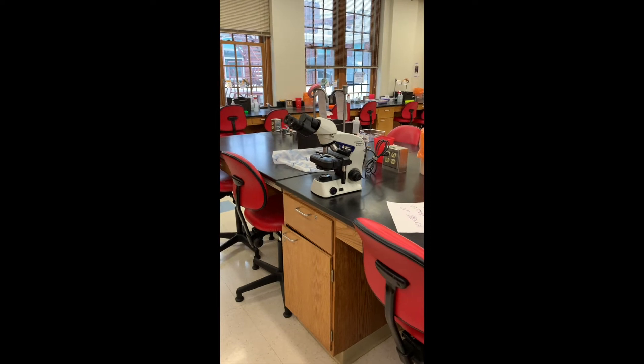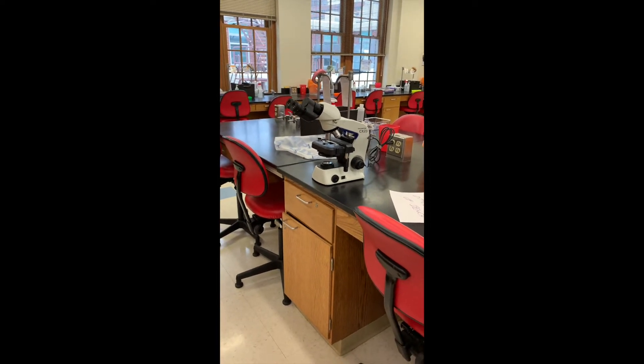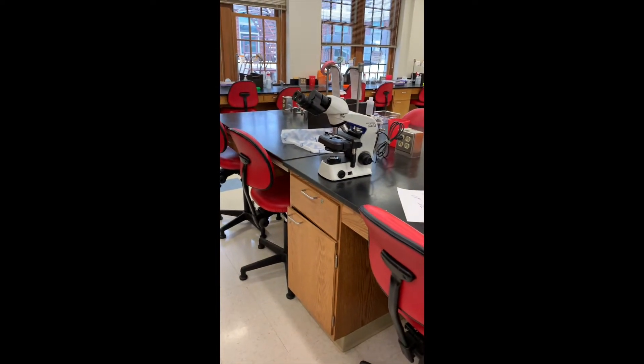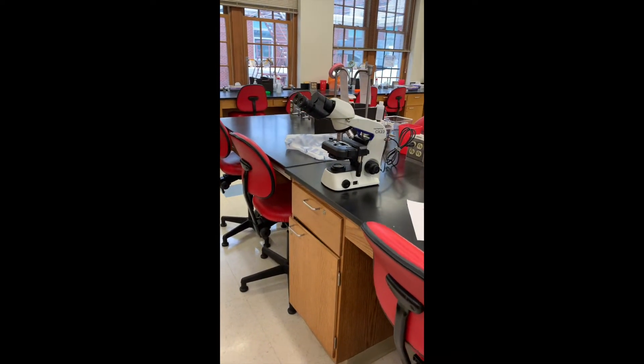Welcome to your introduction to our new microscopes. These are the new microscopes that we will be using during the semester.